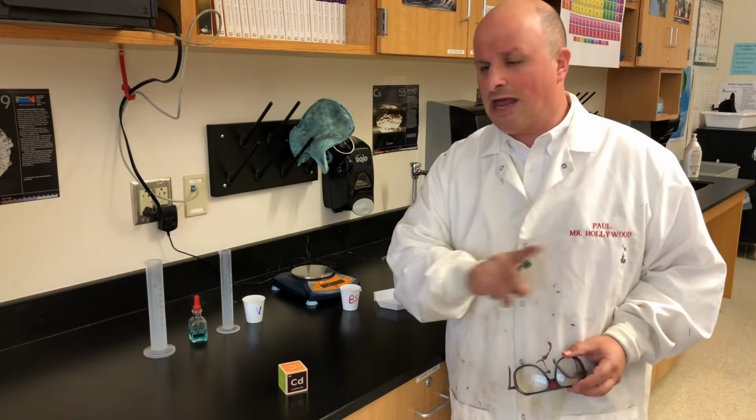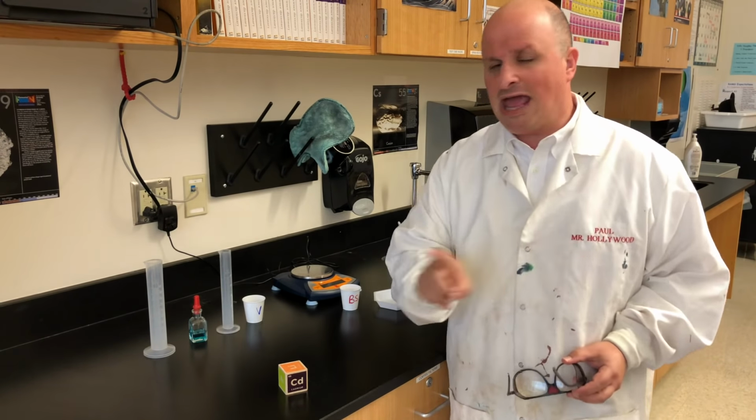So number 1, on any one of these labs, we're gonna talk about safety. For this particular lab, there's no real danger to your health because you're not going to eat or drink any of these ingredients. So because there's minimal danger to your health, really only a danger to your clothes if you spill things on yourself, here's what our safety equipment is going to involve. You're going to wear a lab apron. I'm wearing my fancy lab coat, but you're going to wear a lab apron and you're going to wear safety glasses, not goggles, but glasses. This just keeps things from poking you in the eye, any big splashes from hitting you in the eye. If you have your own glasses and you're wearing them, you don't need to wear these, okay?